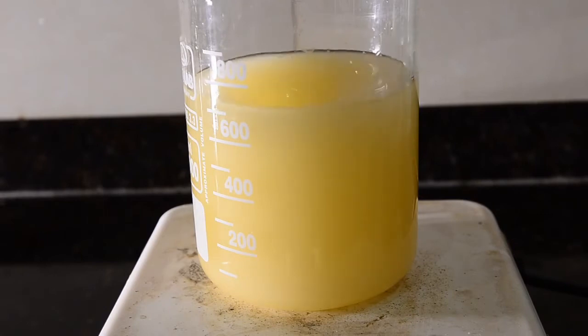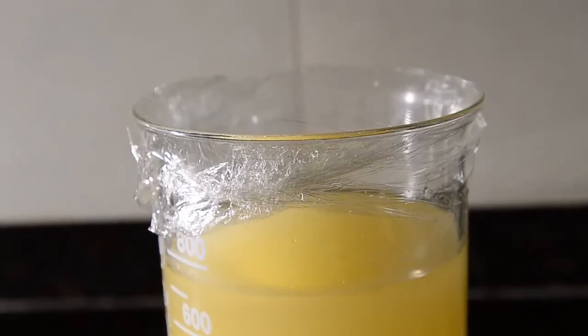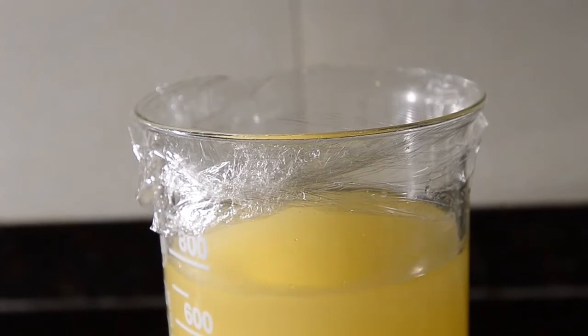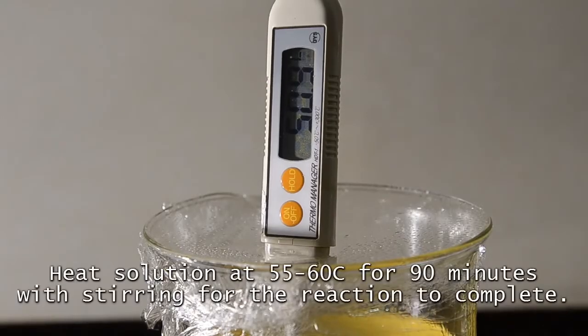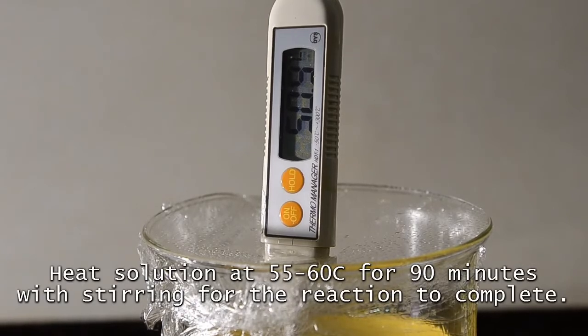Our reaction will now start to take place in the mixture and you'll slowly see the cloudiness fade and the mixture will become a bit less viscous. Cover the top of the beaker with plastic film so that methanol vapor doesn't escape. And now gently heat the mixture so that it is at a temperature of 55 to 60 degrees C for the next 90 minutes.